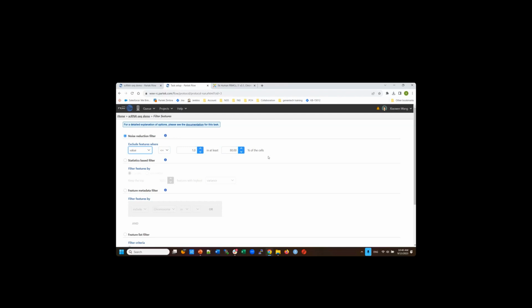Everybody has their own strategy. I like to try to be more permissive. I will say if the gene expression is 0, you can change that to 0, right? It's 0 in 99% of my cells. So you have to do a little calculation. I have 1,000 cells in total, and 99% is 0.